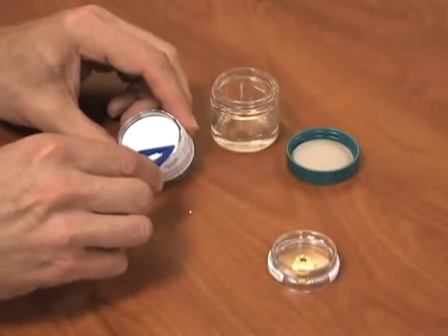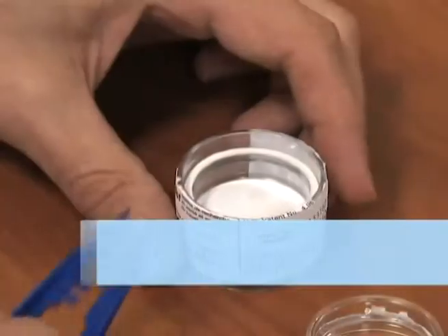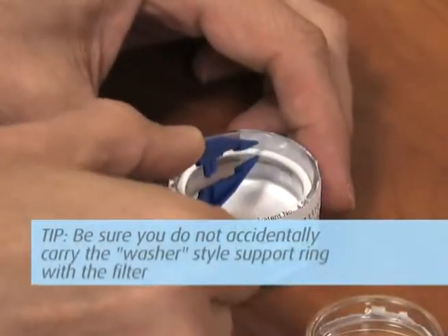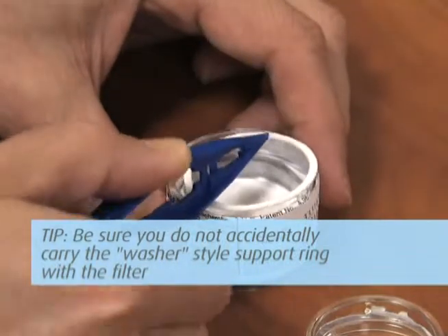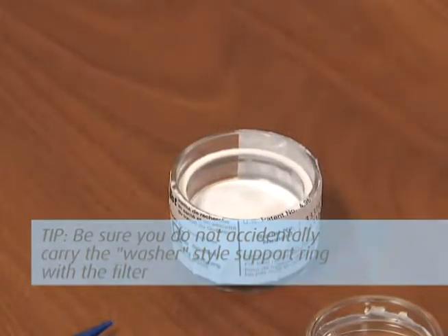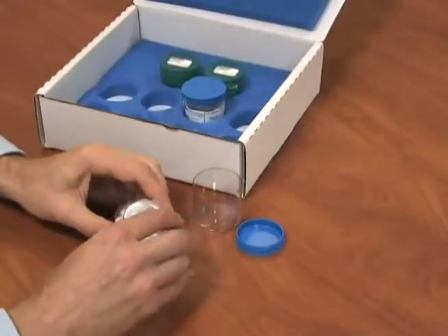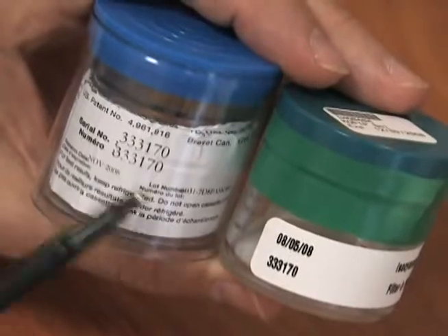Using tweezers, remove the top Teflon filter and place the filter into the jar containing MOPIP solution. Tip: be sure you do not accidentally carry the washer-style support ring with the filter. Leave the bottom fiberglass filter and the support ring in the cassette. Reinstall the top ring and nibs. Ensure the jar and the filter cassette have the same sample ID.